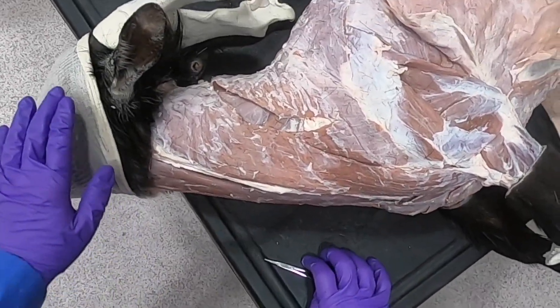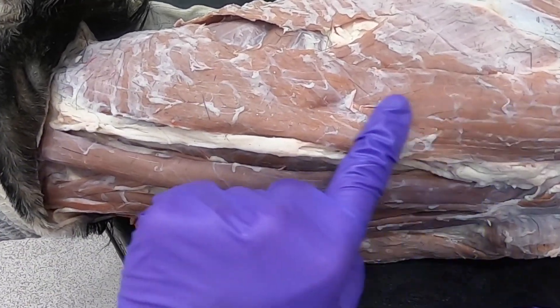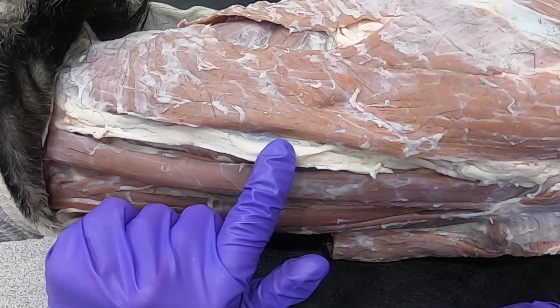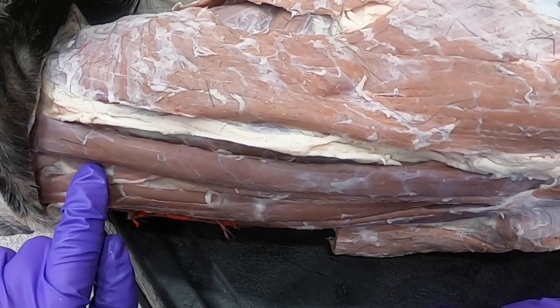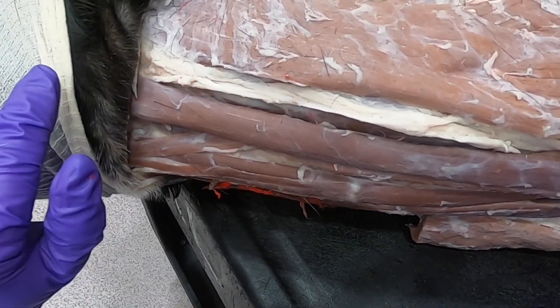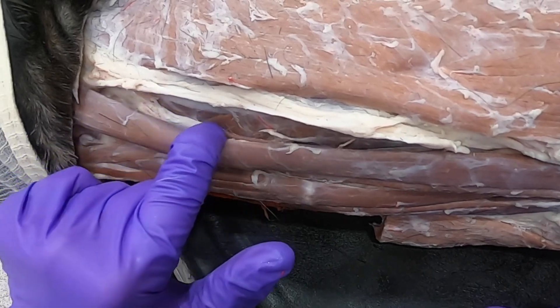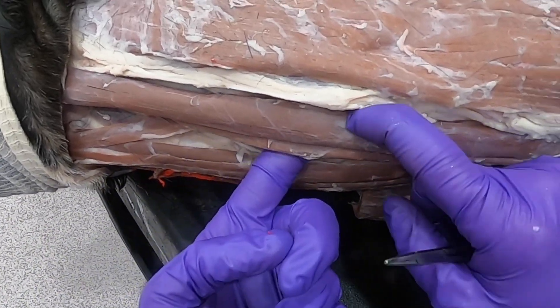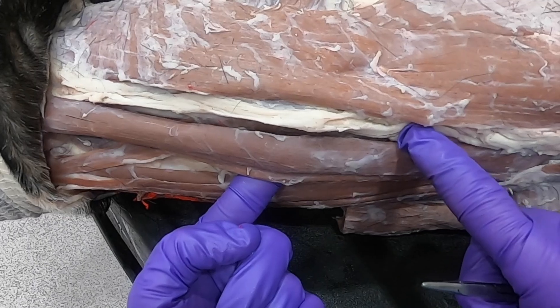Now moving to the neck muscles: looking at the ventral surface of the neck, the brachiocephalicus forms the dorsal border of the jugular groove, and the jugular vein is within the fat here. The ventral border is the sternocephalicus. Just like the ox, it has a mandibular portion — the sternomandibularis — but here it attaches to the zygomatic arch rather than the mandible. There is also a mastoid portion, the sternomastoid, which goes deep to the jugular groove. Overall, this is the sternocephalicus, forming the ventral border of the jugular groove.